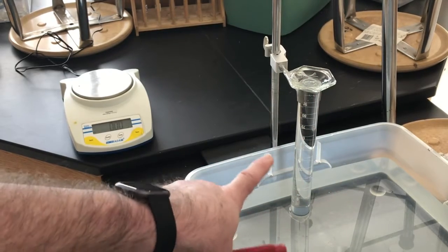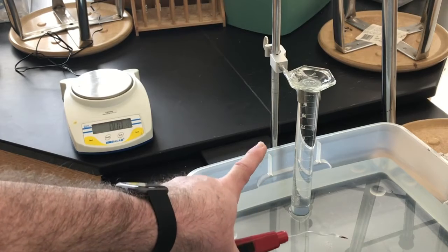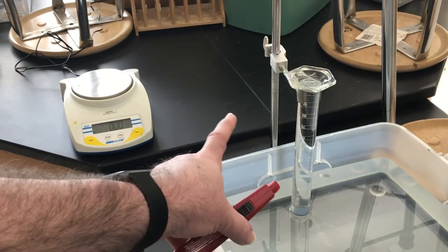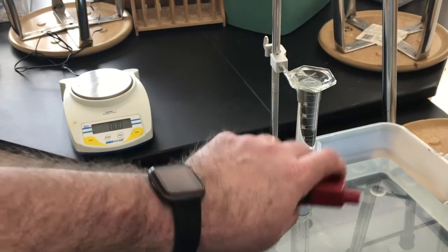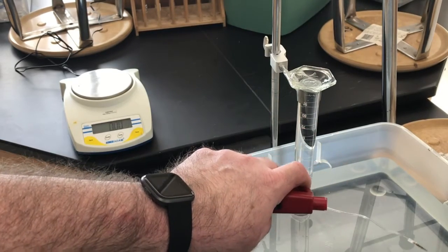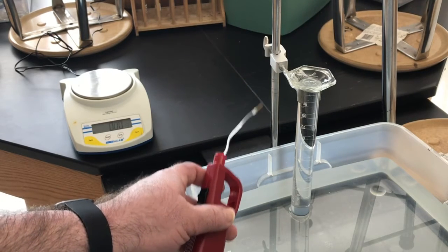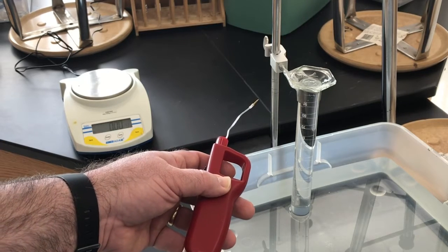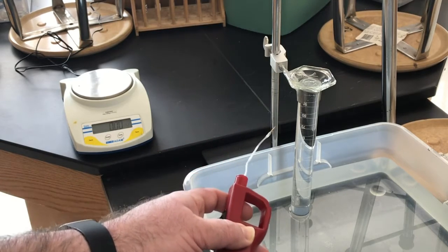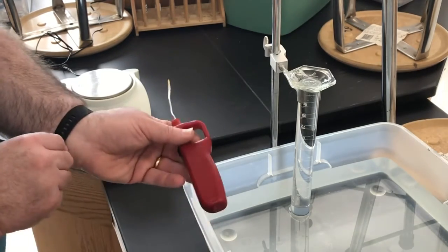Because we're collecting the gas over water, the water inside the graduated cylinder matters. Remember I said earlier that the pressure inside the graduated cylinder is going to be equal to the pressure outside the graduated cylinder, the air pressure outside. Some of that pressure inside the graduated cylinder, however, comes from vapor pressure from water, as we have discussed before.